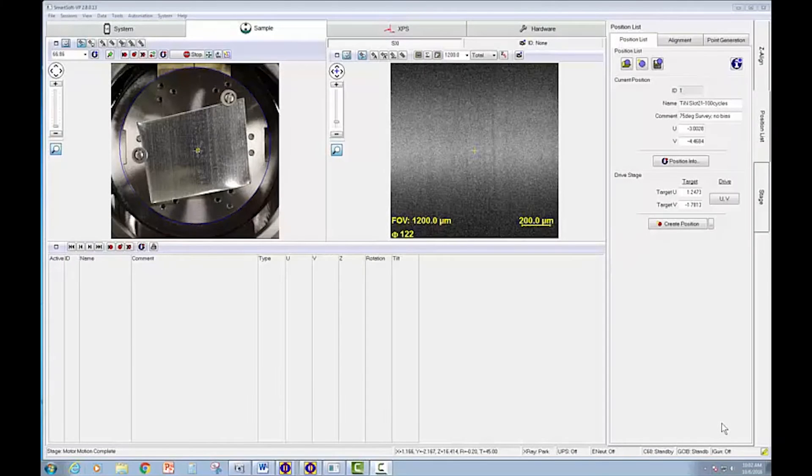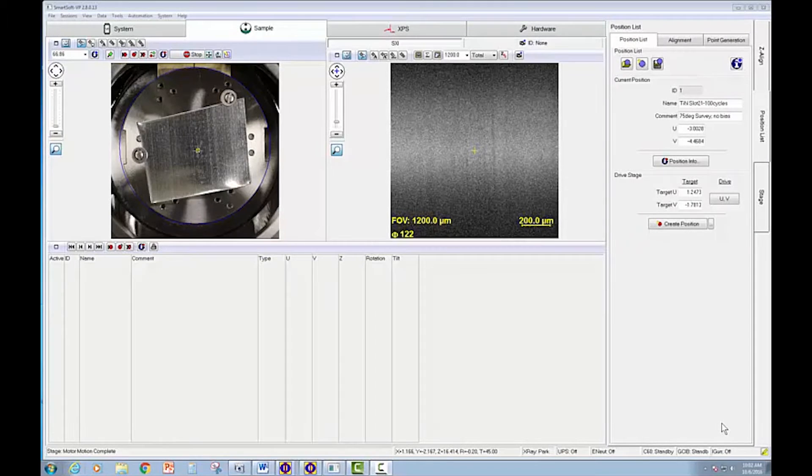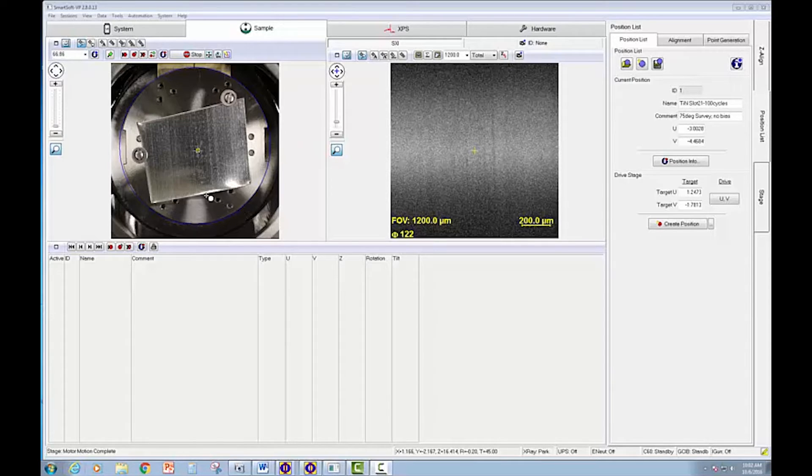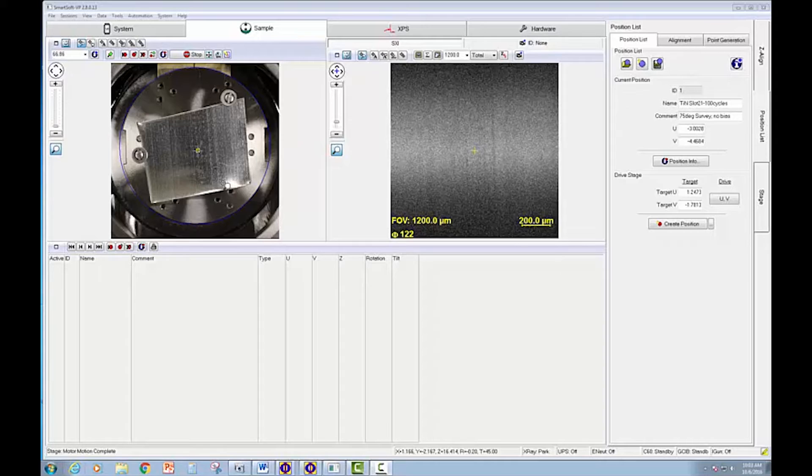In the instrument we have a tin and zinc plated copper metal sample. You can see in the optical image that was taken in the intro that the surface is fairly uniform in composition. We're going to be using SXI imaging to look for defects on the sample surface.